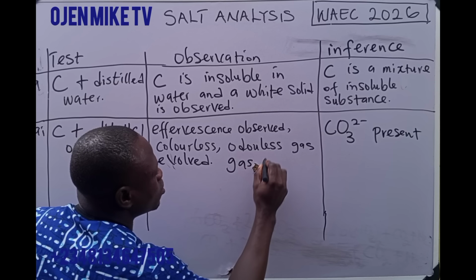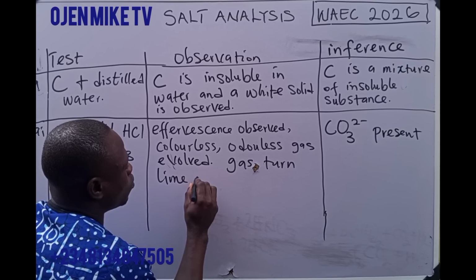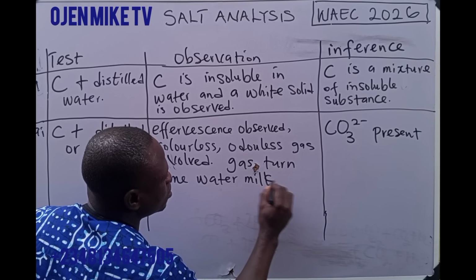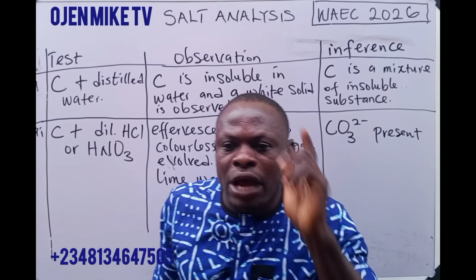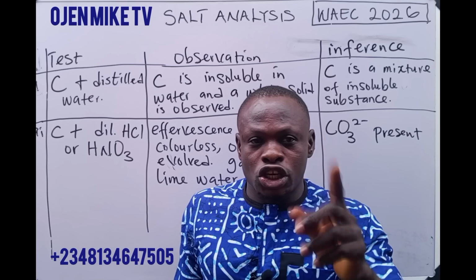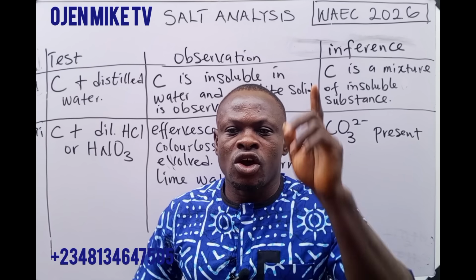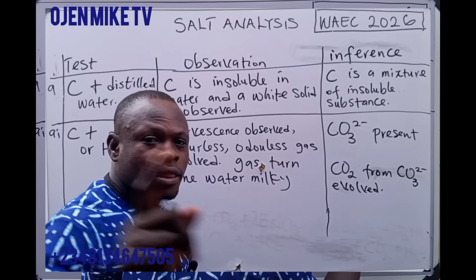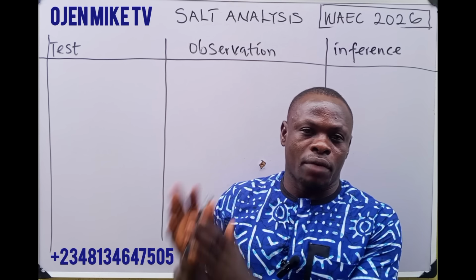Are you following? Any gas that turns lime water milky, of course, is CO2, carbon 4 oxide. So we are finished with the test for carbonate.